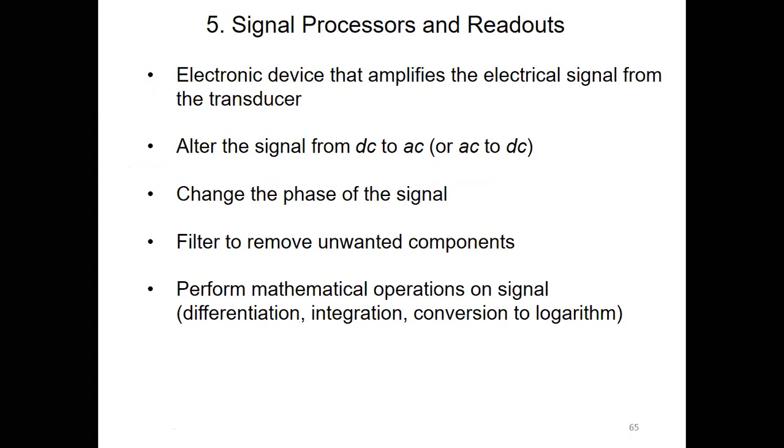So what is happening in the signal processors and readout device? Now we know from the transducer, we will get the electrical signal. So when we have the electrical signal, we are not sensitive to analyze those electrical signals. As a human or the technician, we cannot do anything with that signal.